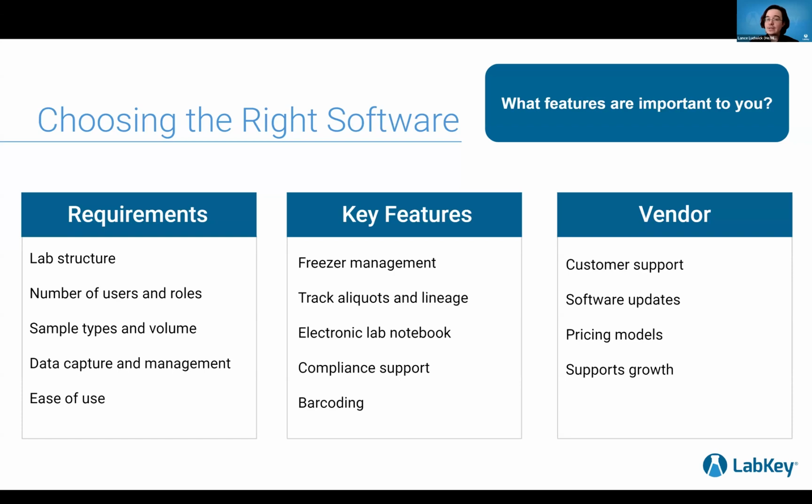And then when you're evaluating a system, it's also important to consider the vendor. How does the vendor price their software? Is it subscription based? Do you pay a one-time fee? Are there any hidden fees? Do they charge more for customer support or charge more for having different sample types? That's all super important to ask when you're looking at different vendors.